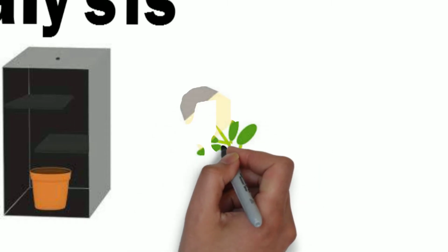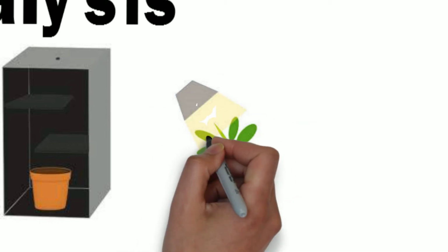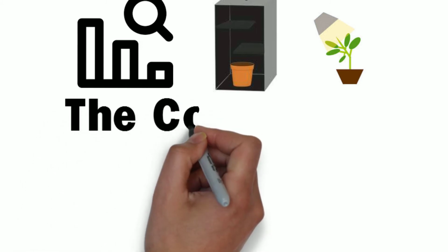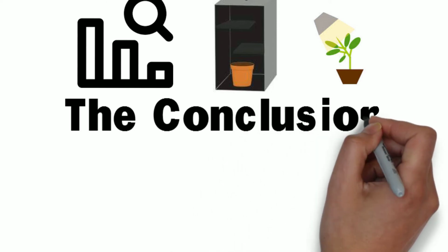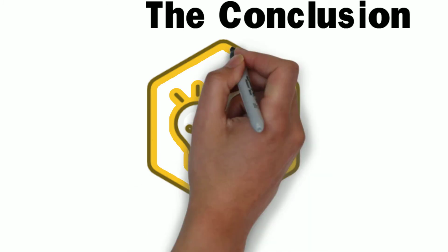This bending ultimately shows phototropism at full effect as the plant bends over to maintain a sufficient flow of light. The results in the experiment do support the hypothesis. This can be seen in how the plant bends in a direction to sustain satisfactory flow of light into the plant, which is required in order to perform photosynthesis.